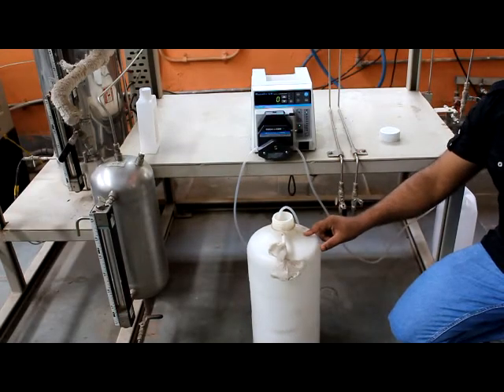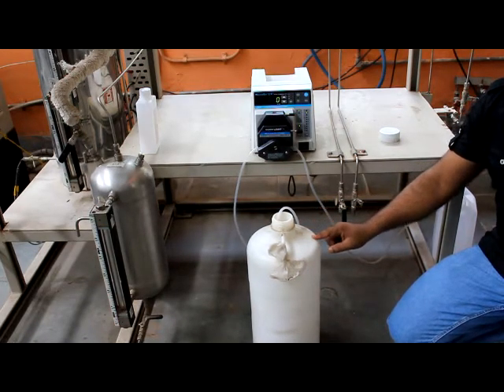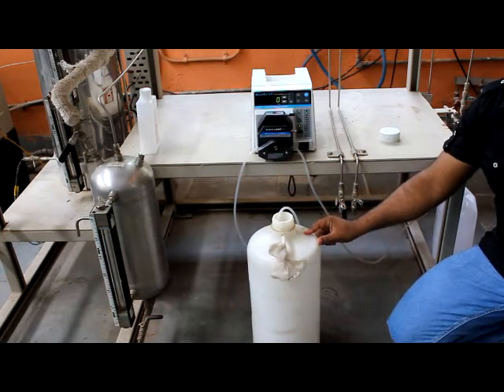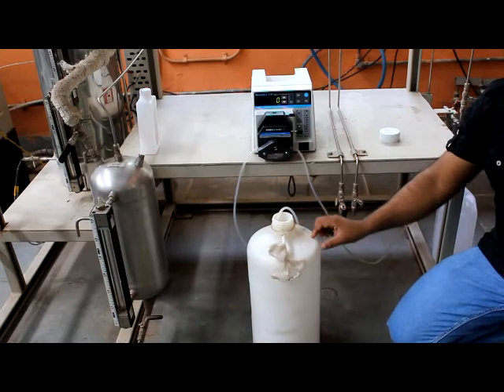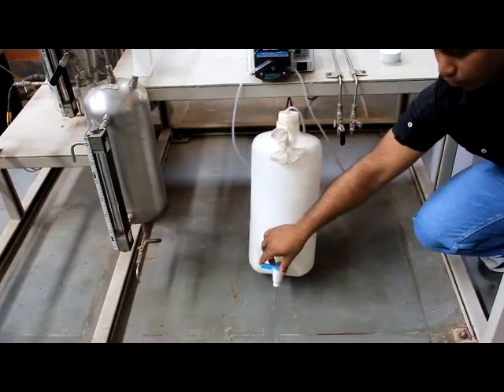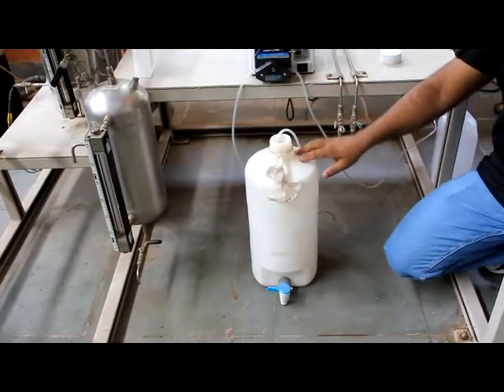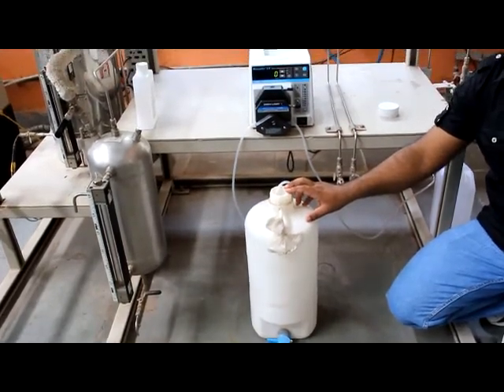A feed container holds a certain feed mixture of methanol, acetone and water. On the preparation side you need to calculate the feed composition from this feed mixture by taking a sample from here. Open it, take the sample, go to the GC analysis, and calculate the feed composition with the help of the gas chromatograph.